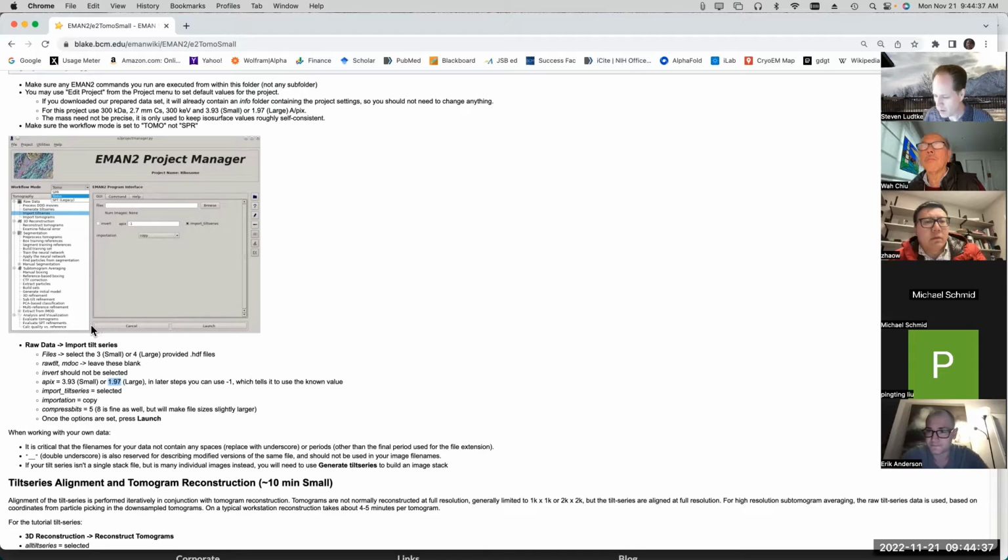So I'm saying, if you run SerialEM and collect your data that way, the order it collects them in is what it documents in the MDoc file. But then when it generates an output tilt series, if you generate a tilt series in a single stack, by default it reorders things for you, or at least most of the files I have seen are already reordered for you. So they then don't match the ordering that was identified in the MDoc file in that situation. So you can just look at the raw tilt series, right?